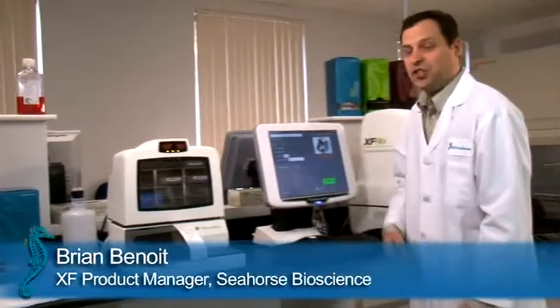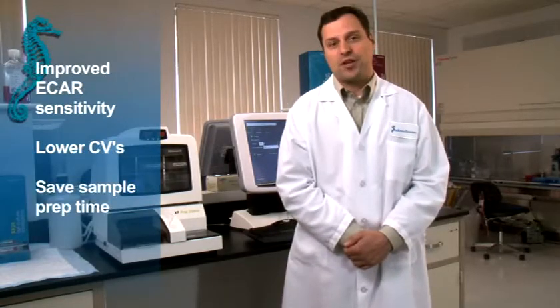In summary, the XF prep station, used in conjunction with the XF analyzer, makes assay preparation fast, easy, and error-free. Using the XF prep station, your assays will experience improved ECAR sensitivity, your data will have lower CVs, and you'll save time on sample preparation.